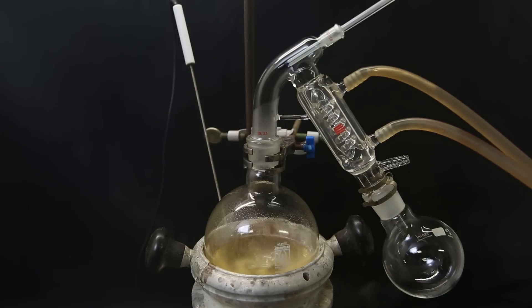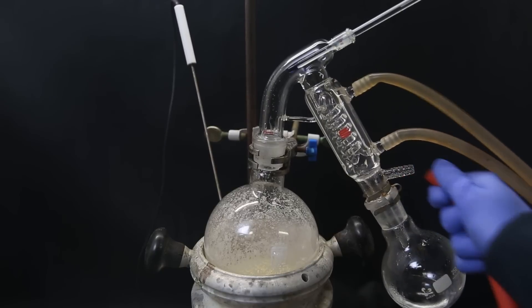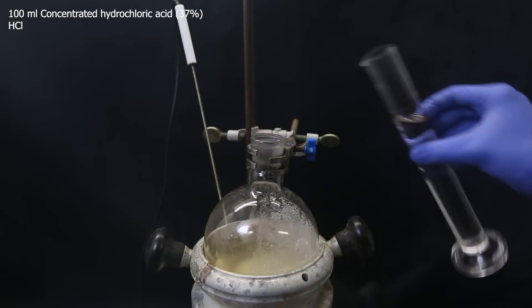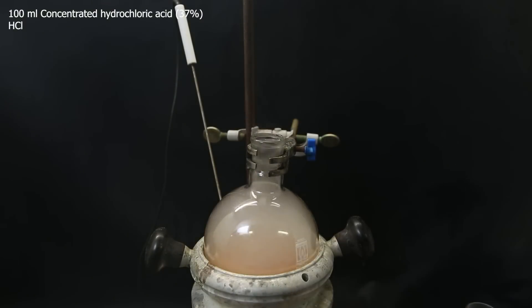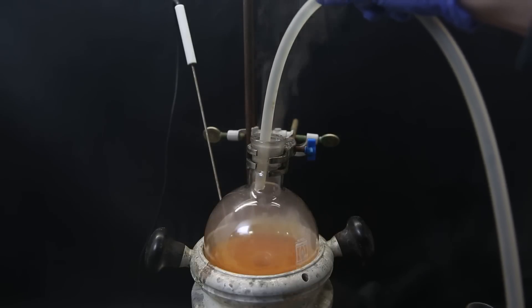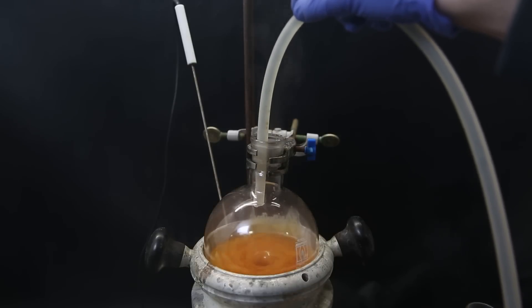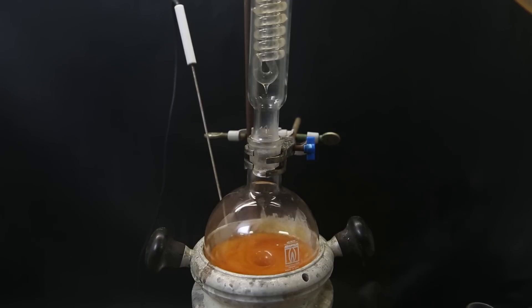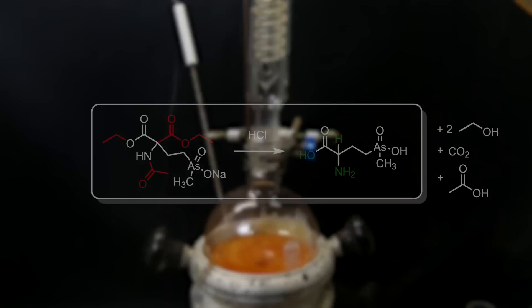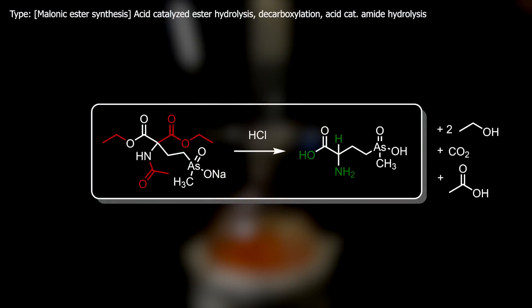I evaporate off all of the solvent, then for the next reaction I add in 100 ml of water and 100 ml of concentrated hydrochloric acid. It immediately turns orange, and I remove the acid vapors by flushing with nitrogen, then set this mixture up for a reflux for 3 hours. In this reaction, we are completing the malonic ester synthesis by hydrolysis of the esters, a decarboxylation, and an amide hydrolysis, all with aqueous acid and heat.